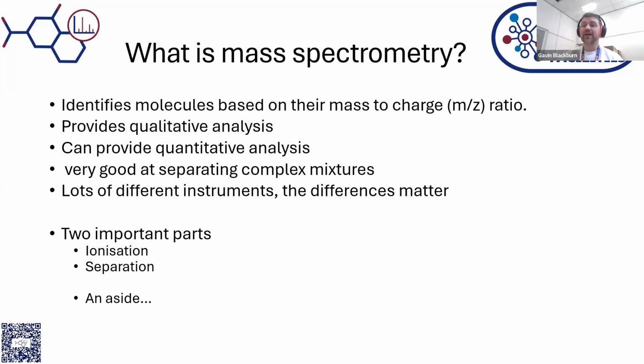And the idea behind these webinars is that this one's going to give a grounding in mass spec, and then the next webinar I give is going to give a bit of a grounding in the techniques that we can apply to be able to separate those things out. And then we'll go on in depth about proteomics, metabolomics, and lipidomics, and hopefully build up a really nice series that people can come back and refer to.